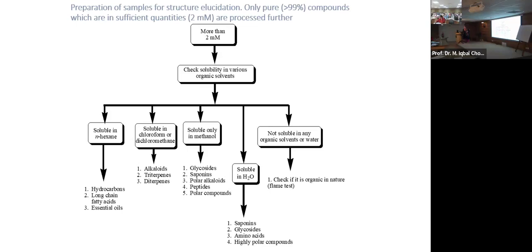Why do we use deuterated solvent? So far, you have studied that there is a big magnet, and you are giving the radio frequency.